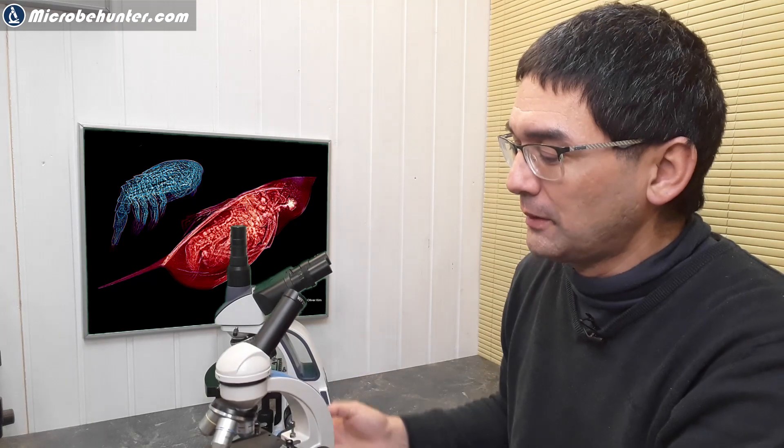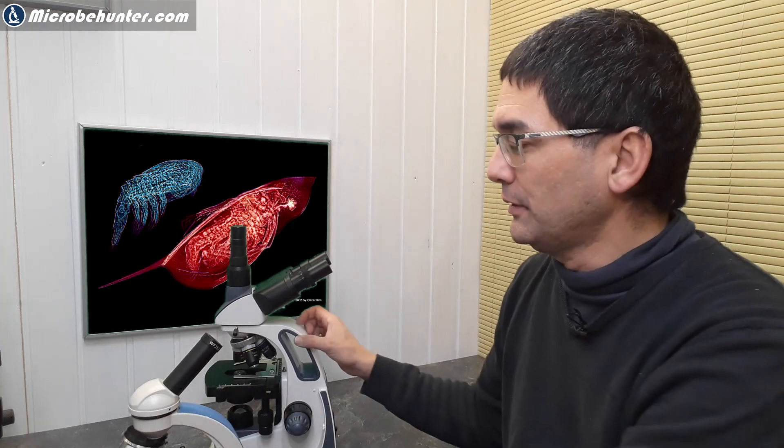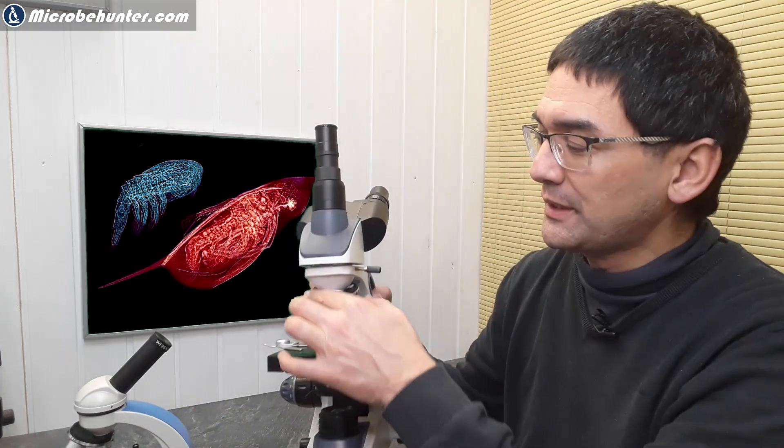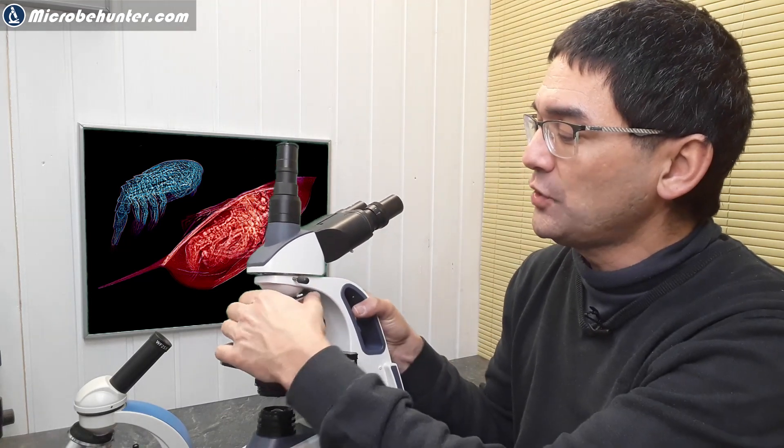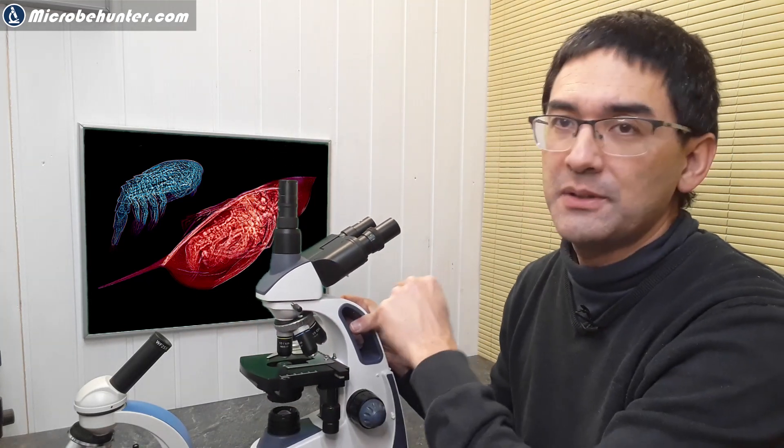So first of all, a couple of things that I would like to clarify concerning the microscope hardware and some of the differences that you've addressed in your question. Both microscopes here, of course, have 4x, 10x, and 40x objectives. But this one over here also has a so-called 100x oil immersion objective. You know, that's the one with the white ring over here, which gives you a total magnification of a thousand times. So 100x times 10x eyepiece gives you a thousand times total magnification.